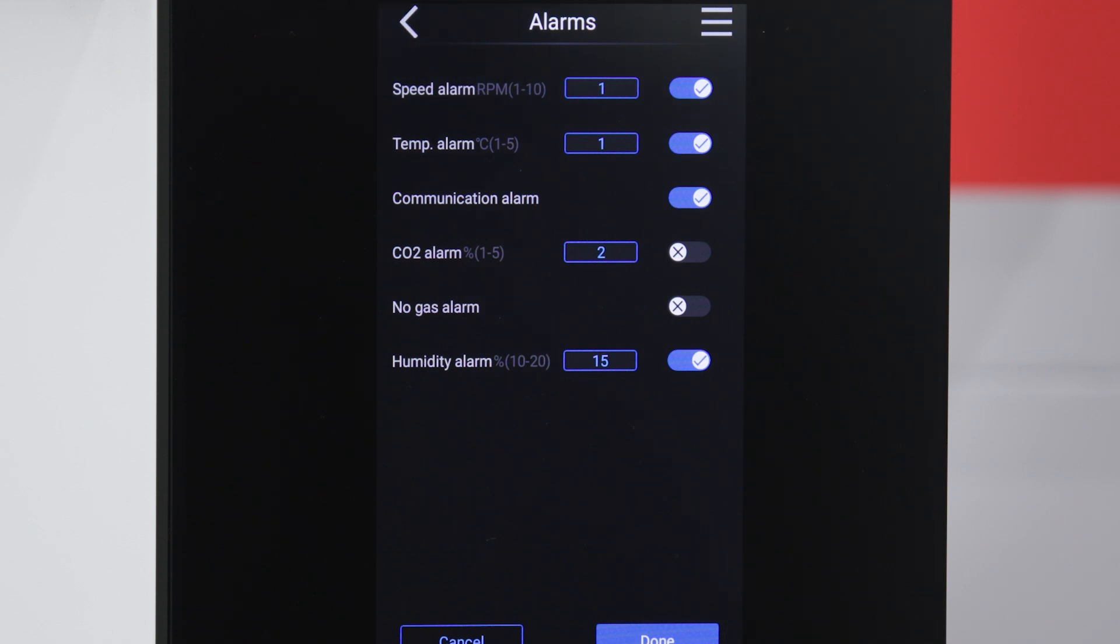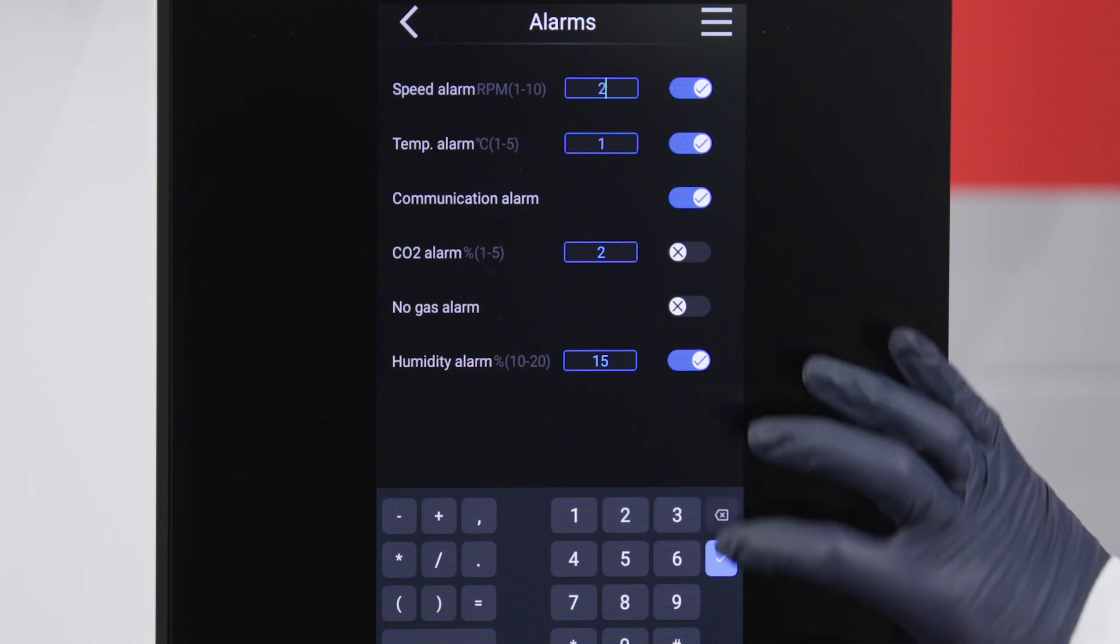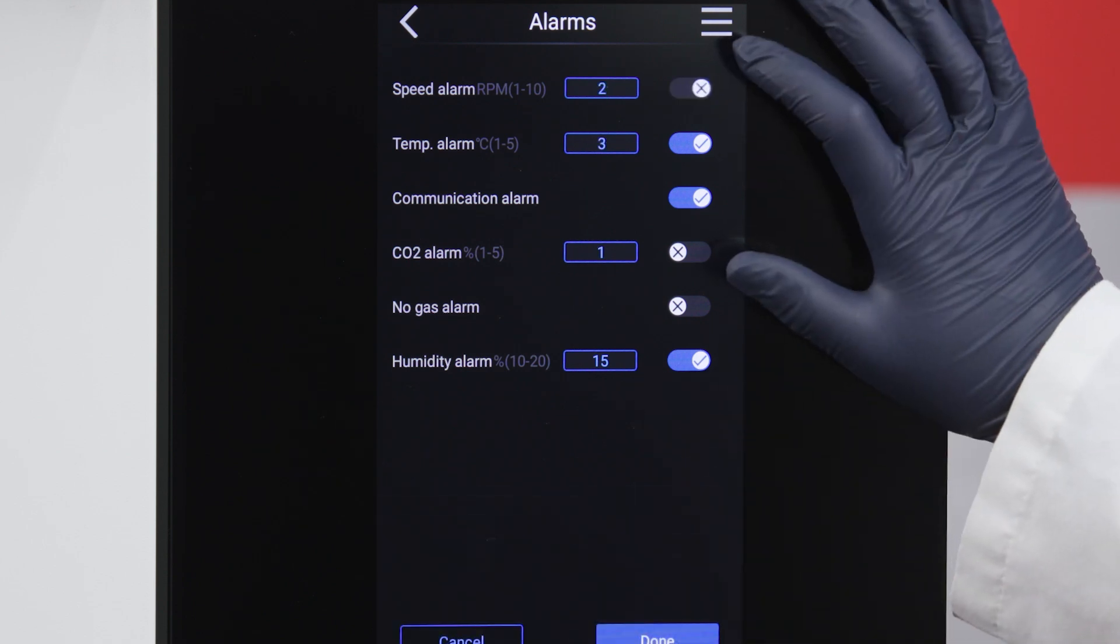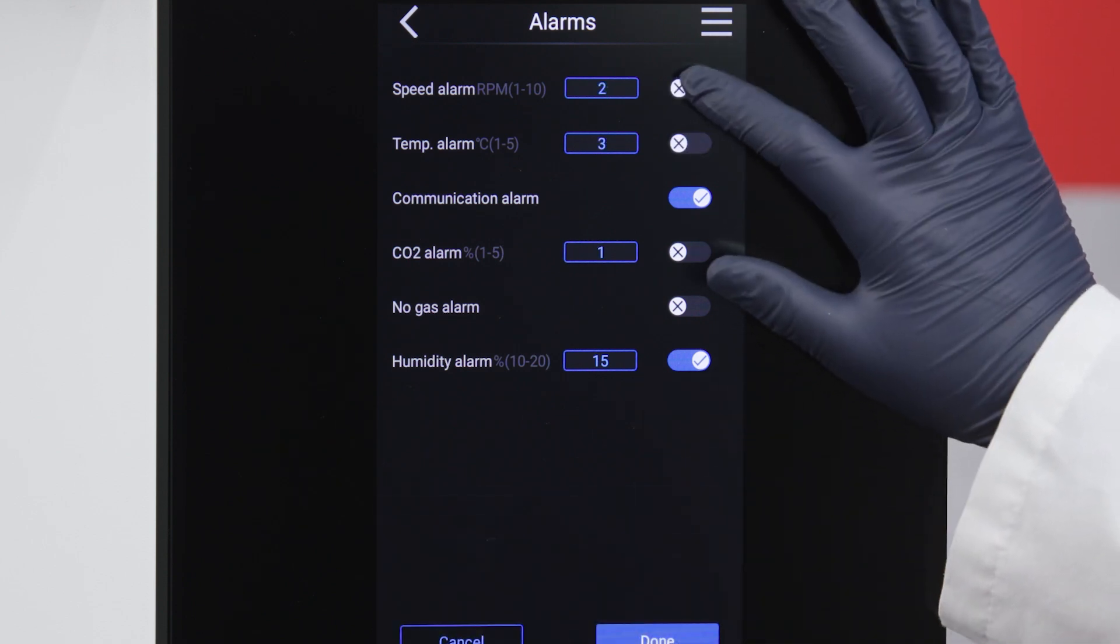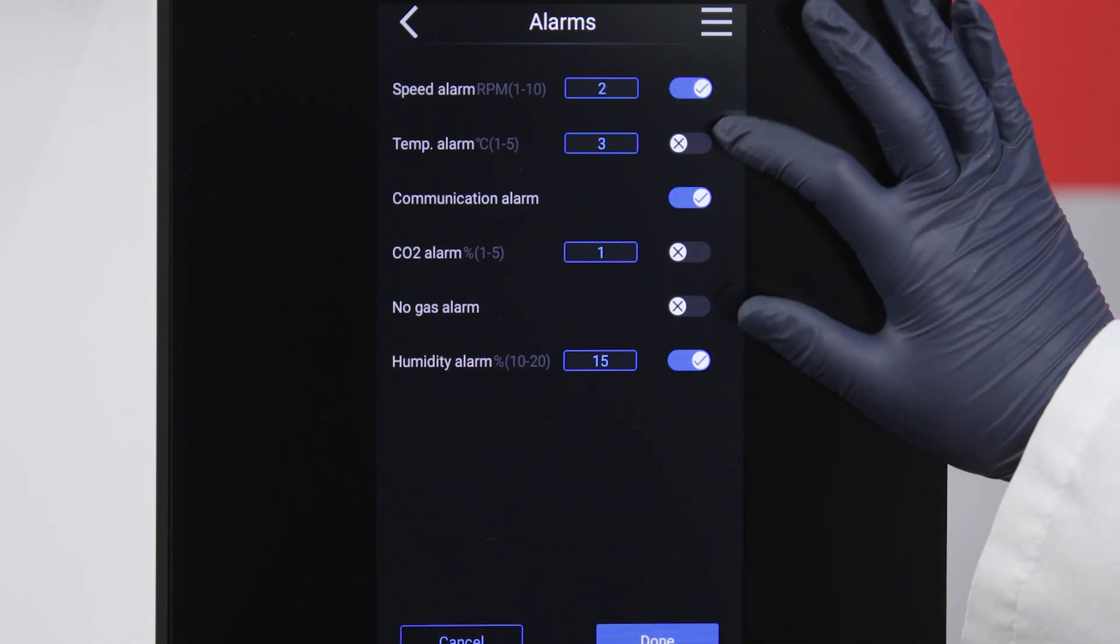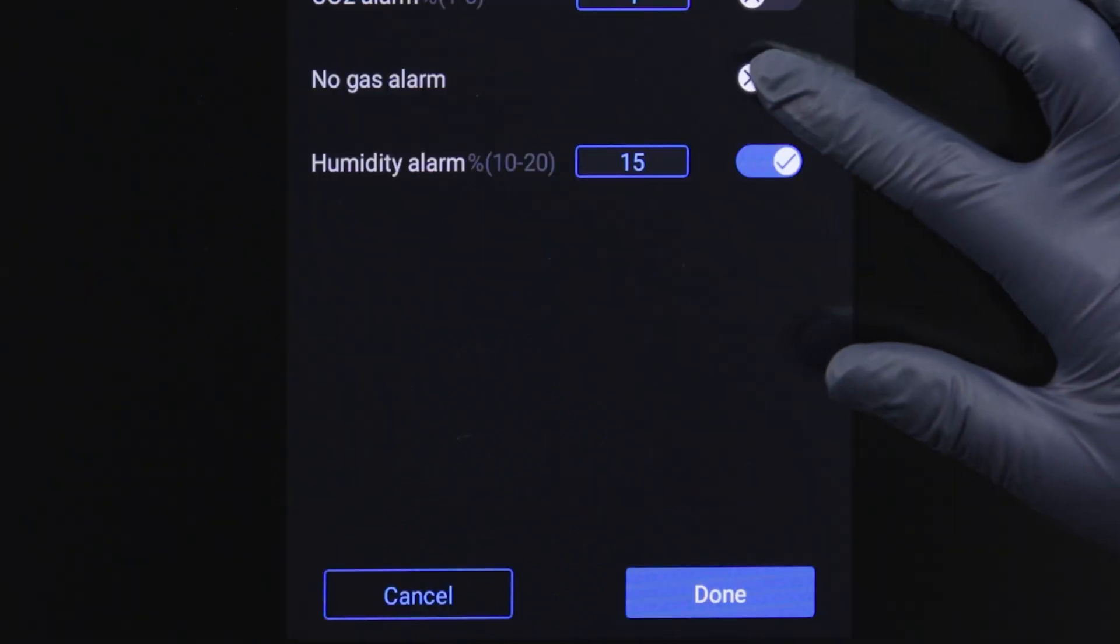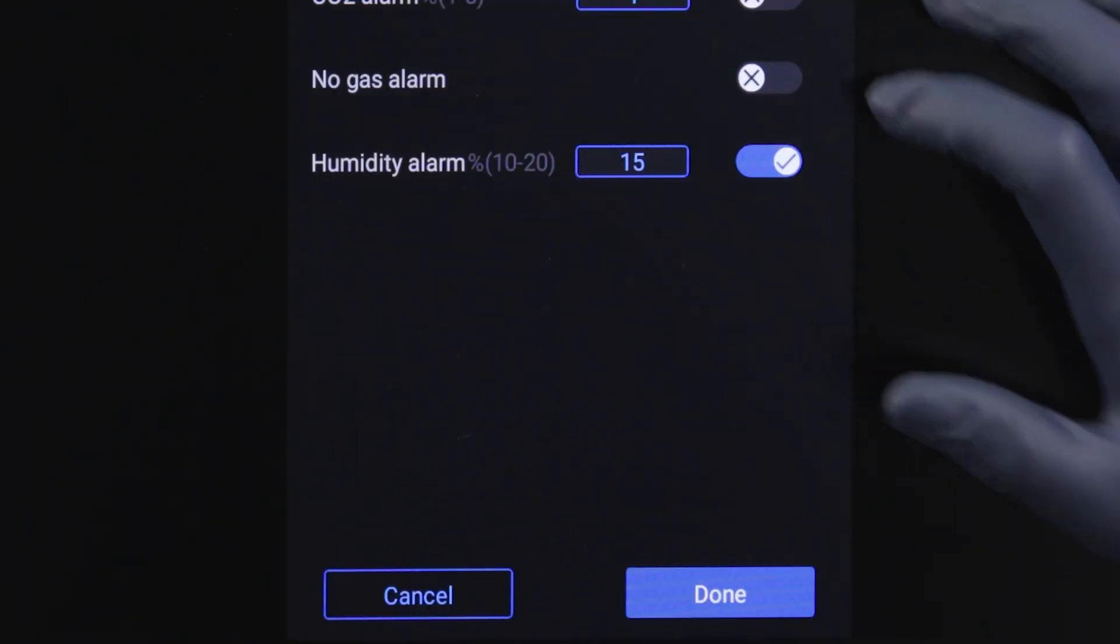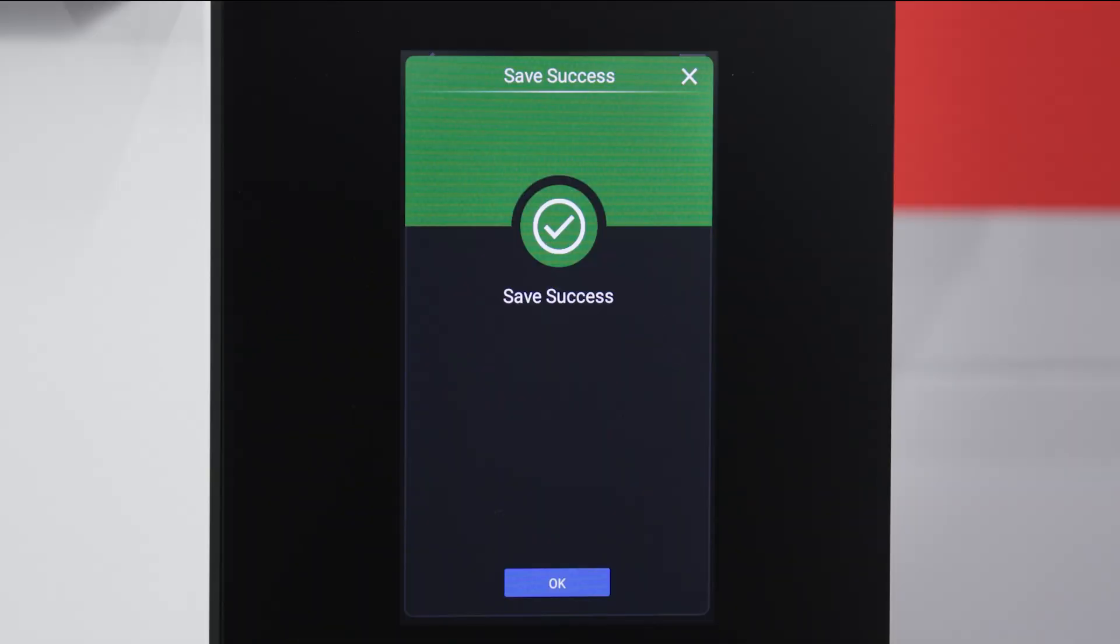Enter your settings for speed, temperature, CO2, and humidity, and use the slide bars to activate them. Click Done, and your alarms are set.